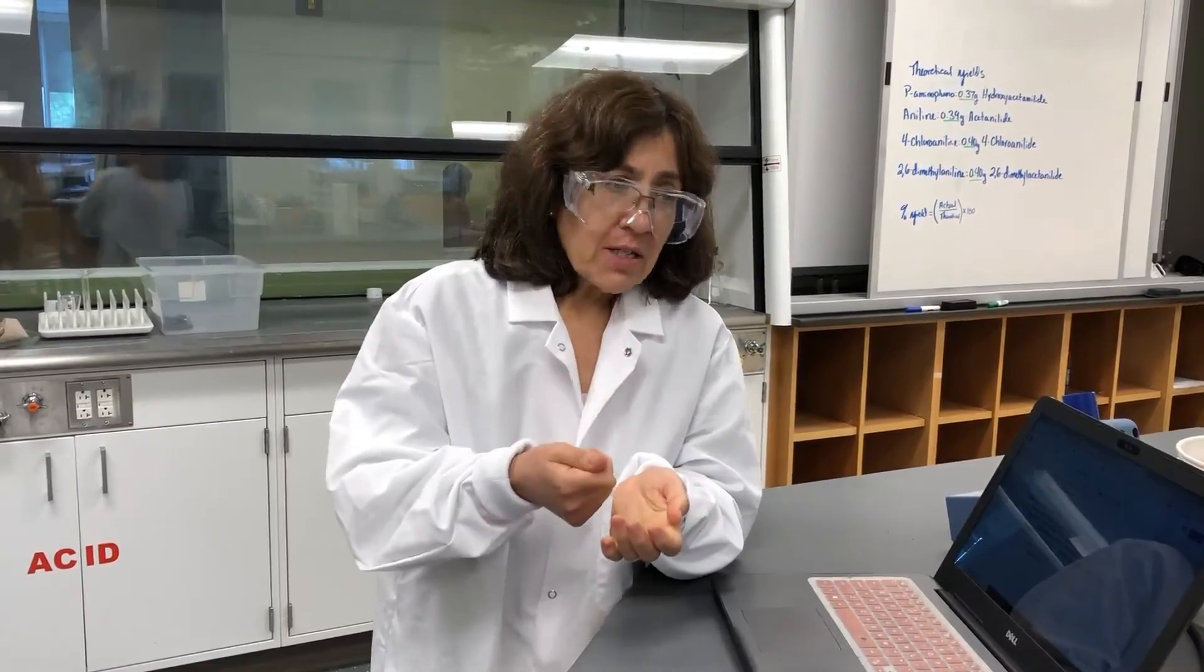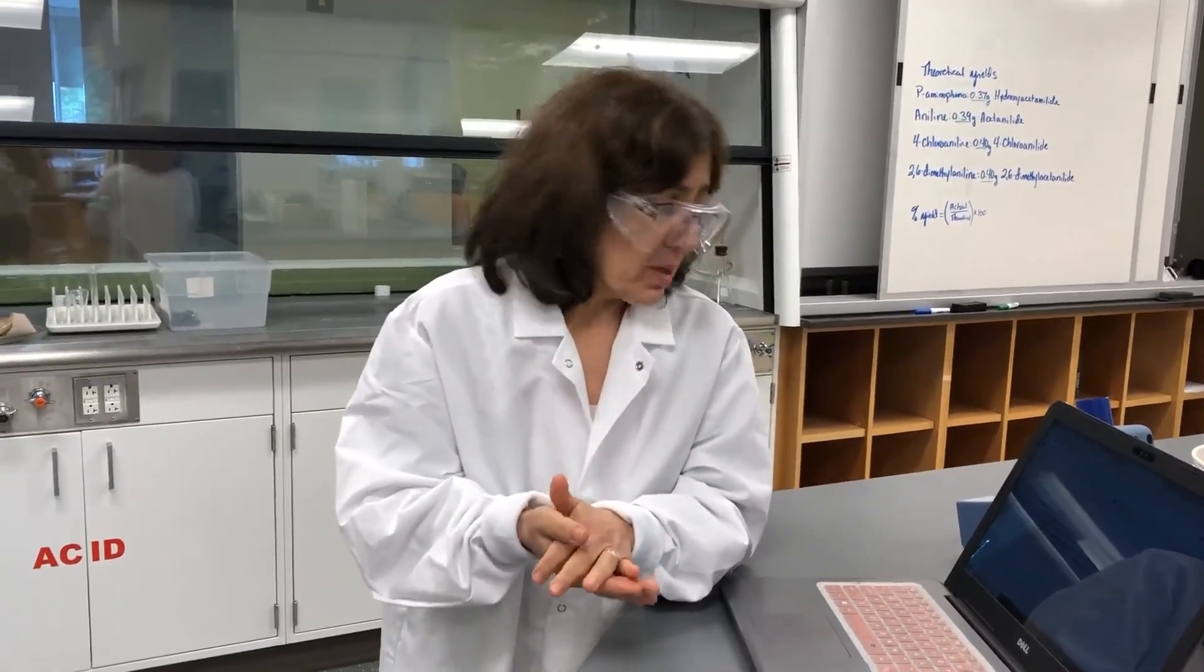When you're venting the sep funnel, you should always point it away from you while you're in the hood. The stopcock on the sep funnel should be tight, and it should be in the closed position when you're adding liquid to the sep funnel. Otherwise, if it's open, everything you put in will just spill out the bottom.